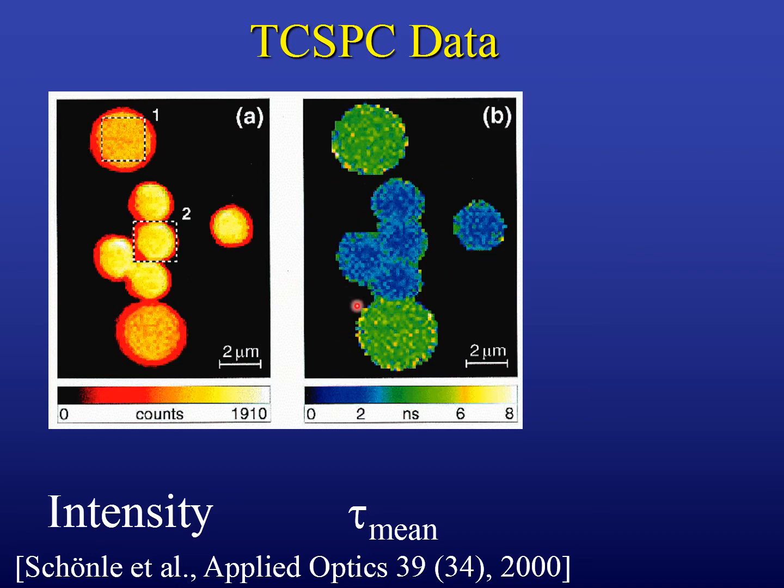Note that you can tell them clearly apart from their fluorescence lifetime, even though the intensity you measure, so the color of the dye, might be exactly the same. If you just looked at the brightness, you wouldn't be able to do that. They might be brighter or less bright, or even the same brightness. However, by looking at the fluorescence lifetime, you are able to tell them apart.